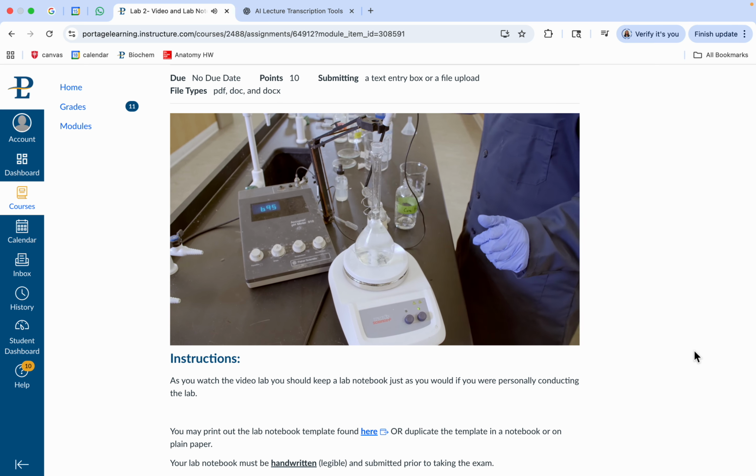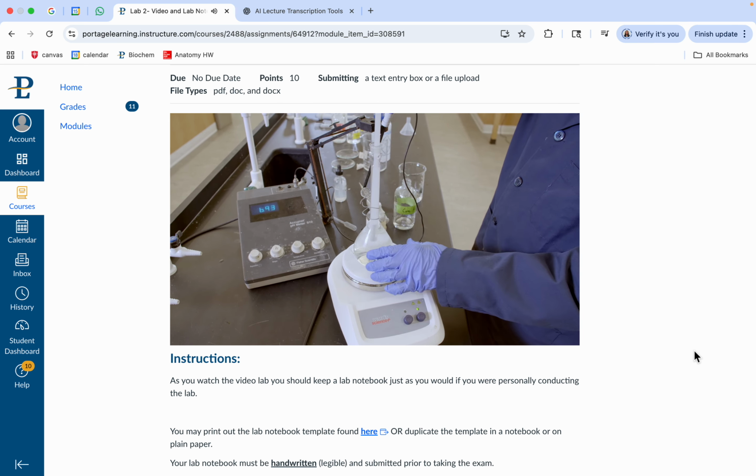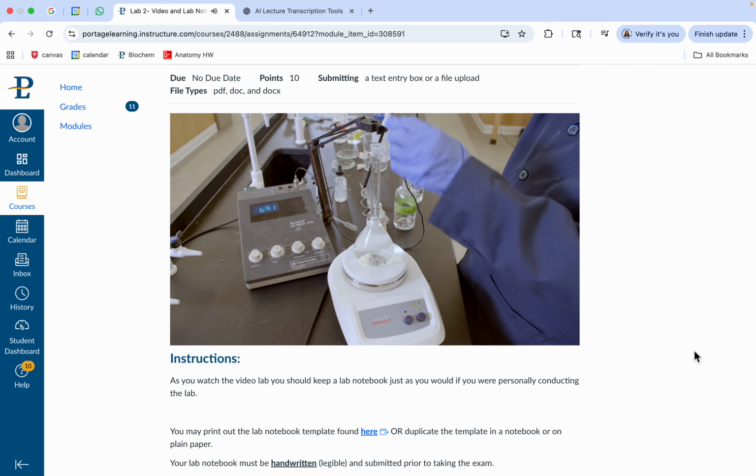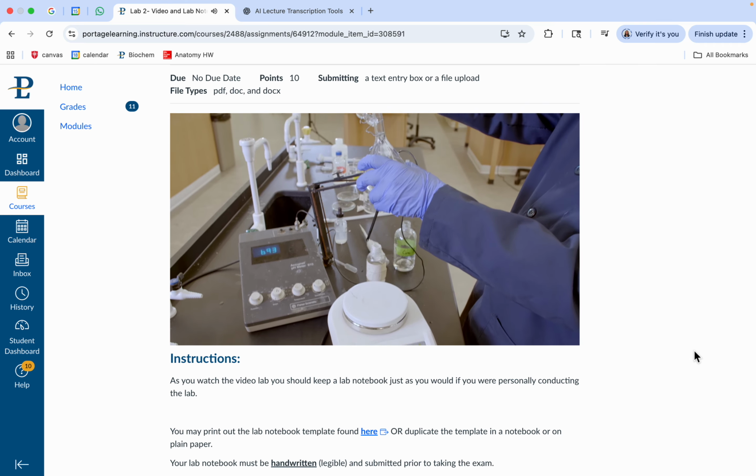One of the other things we'll need to do is stop. We have this magnetic stir bar in the bottom, and that actually takes up volume. Because of that, we want to remove the magnetic stir bar from this. So we use the stir bar extractor, which is a magnet inside of a plastic rod, and that will allow us to pull out the stir bar.